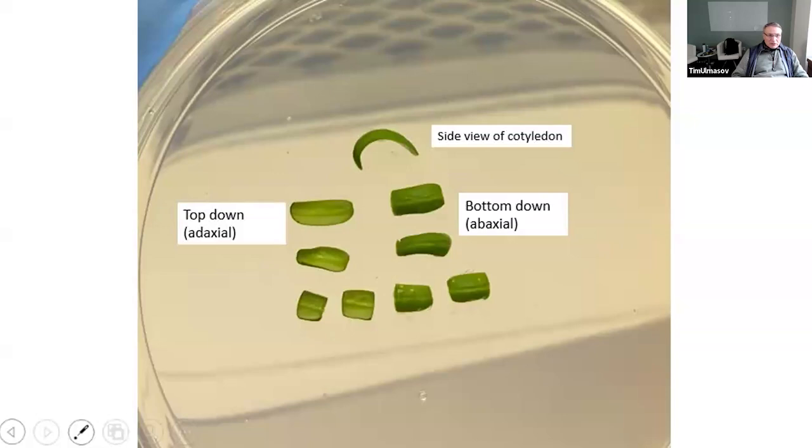So instead of an OD600 of 0.6, he was growing it almost to maturity, or maybe to the steady phase, and it didn't affect the transformation rate, at least in cover cress. So I was curious, you mentioned you check the OD, but what's your target OD, and have you looked into different concentrations of the agro? The target OD is 0.6. We certainly looked at target ODs when we started to get the most efficient transformation, and 0.6 was that sweet spot for tomato.